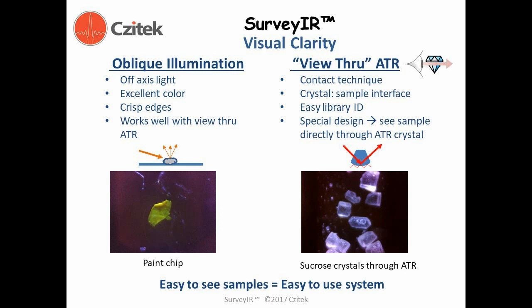We are pleased to demonstrate a sample analysis using SurveyIR interfaced to the Thermo Nicolet iS5 FTIR spectrometer. In this example, we're going to be using a diamond ATR sample analysis method.